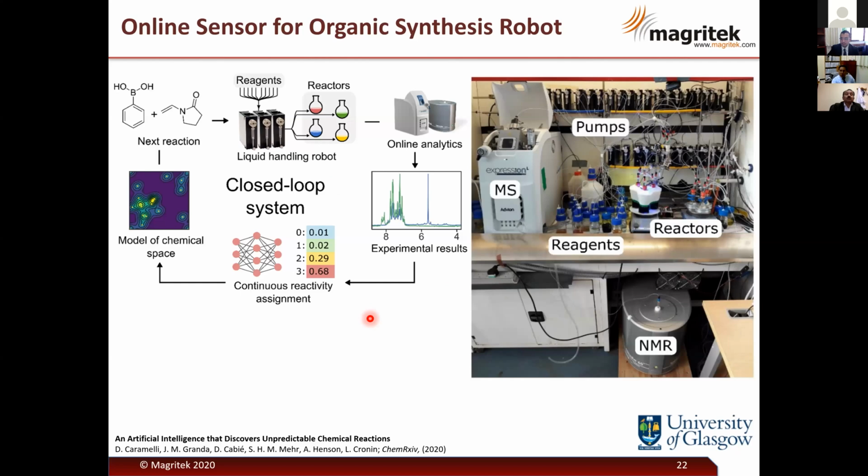So one outcome of this organic synthesis robot was a multi-step single substrate cascade reaction shown here. This is a new mode of reactivity for the methylene isocyanide. In this reaction, p-toluenesulfonylmethyl isocyanide, in the presence of an activator, in this case diethyl bromomalonate, reacts consuming 6 equivalents of itself to yield a trimeric product in a high yield of 47%. This is without optimization.